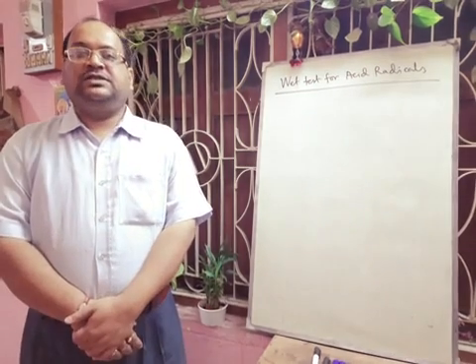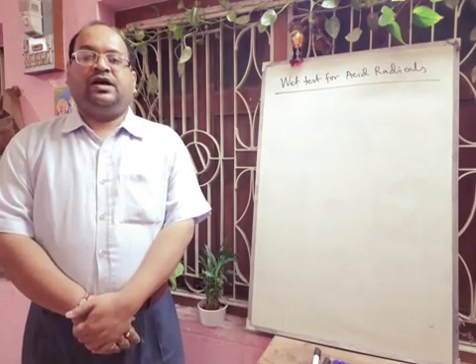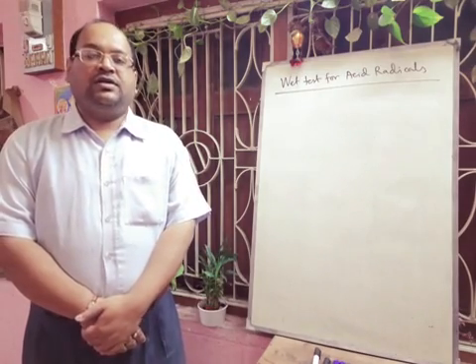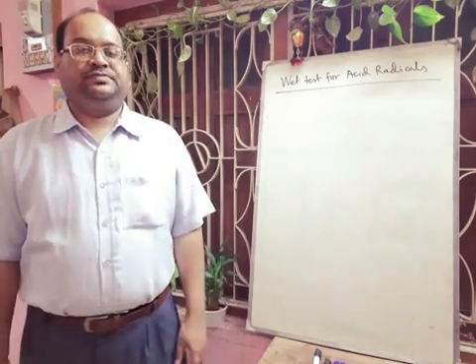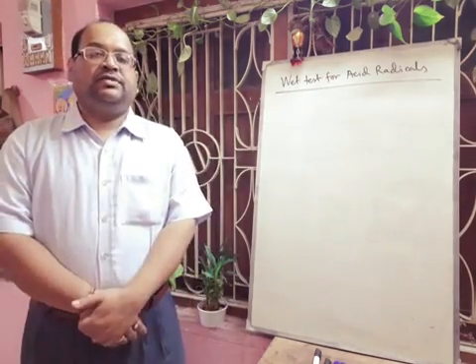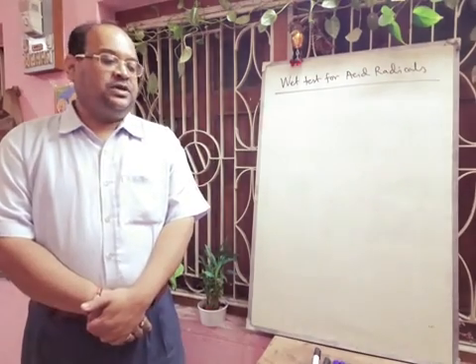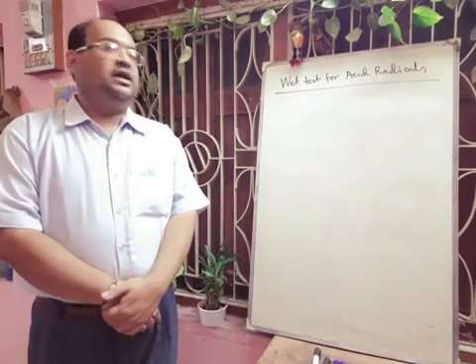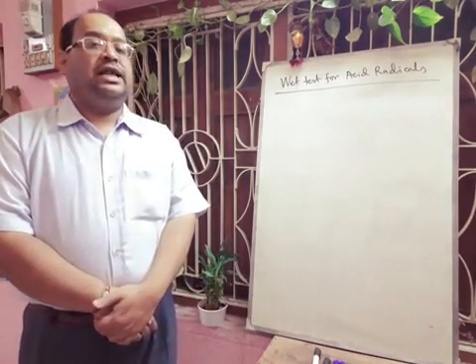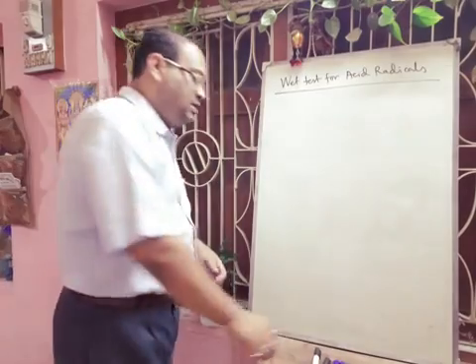Welcome to the chemistry practical class, and today I will continue the wet tests for acid radicals. Okay, last day we discussed up to the confirmatory test of nitrate and nitrite, and today we will start from the halides. First we will discuss the chloride test.